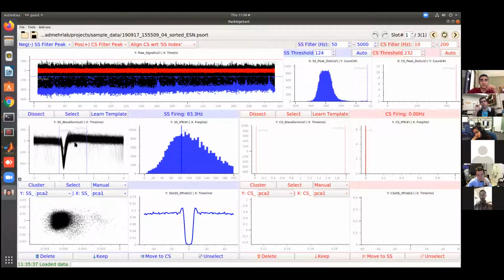Right now, we just use one template. If you want to be super fancy, maybe you might want to improve the software because this is open source, and define 2 templates and then align with more than 1 template. You can also do that, although currently we don't have it. But if you're interested, you can actually improve the software and do those types of things as well. Not yet, it was just a question for now. Yeah, thanks.